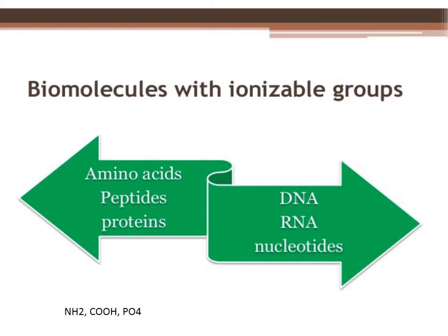Some lipids also contain charges and can be separated by means of electrophoresis. Most lipids are nonpolar and they are not charged. However, a few lipids, like phospholipids, contain charges on them and can be separated through electrophoresis as well. Mostly, we separate proteins and nucleic acids by the process of electrophoresis.